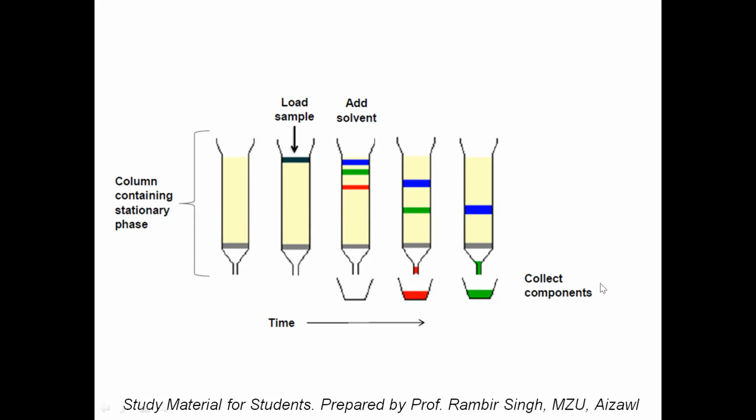So when we are using a reverse phase column, the mobile phase is water. We start with water. Now, if I use water as a mobile phase, will it be a strong mobile phase or a weak mobile phase? That is a question. Based on that, we will use a word called elution strength.